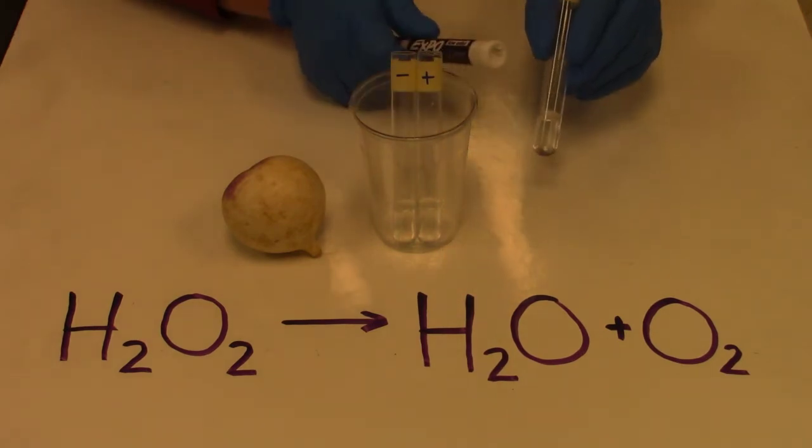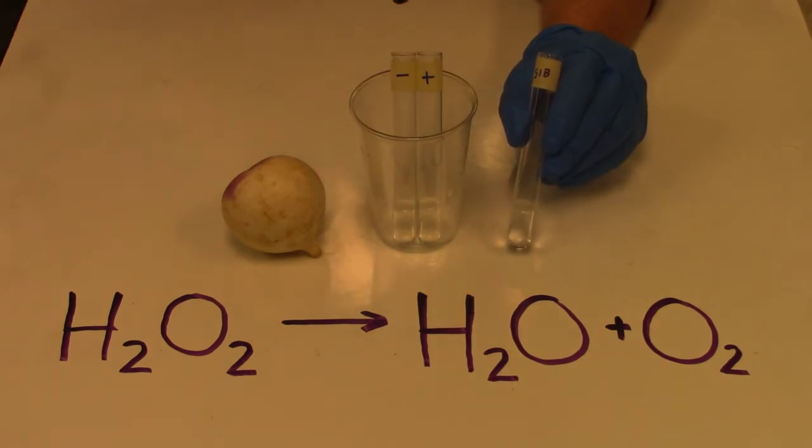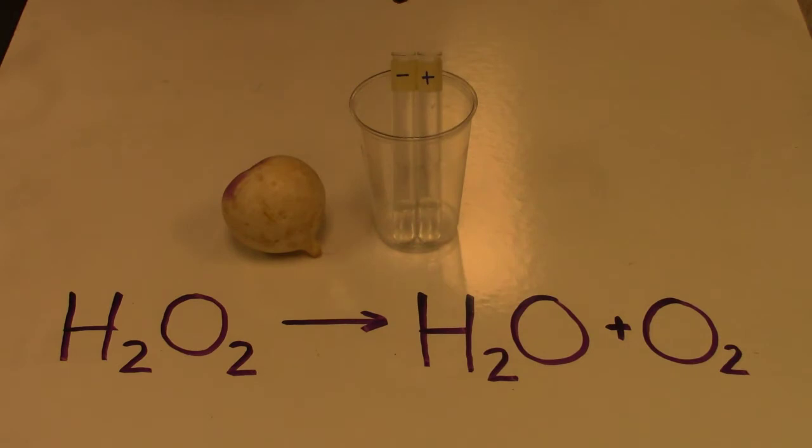The last thing that you're going to find in this tube is buffer. And again, we want to keep this at a nice neutral pH, making sure that our substrate and our enzyme solutions are going to be at the consistent pH of 7.